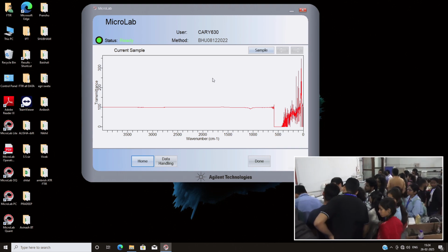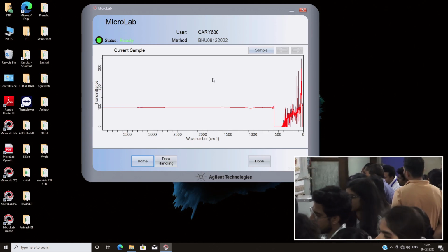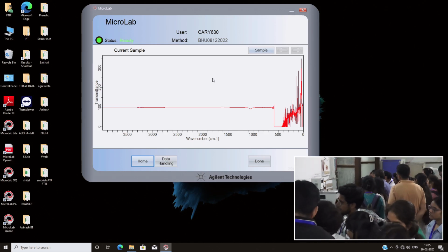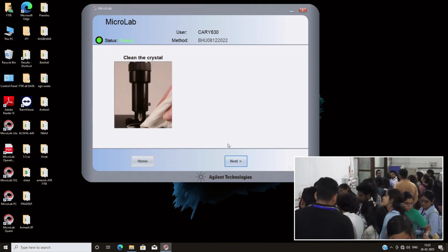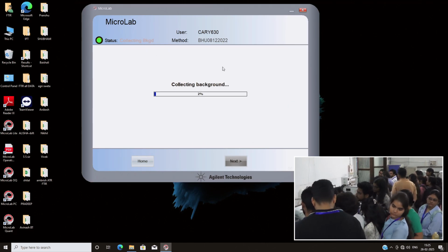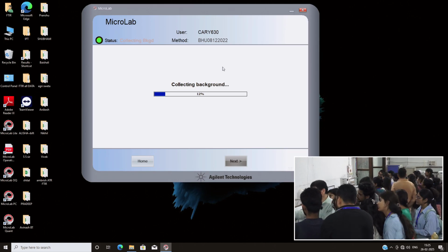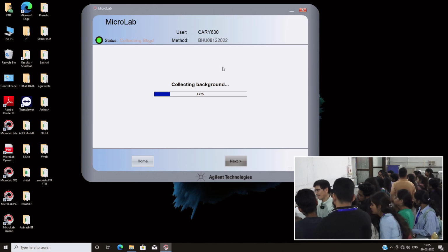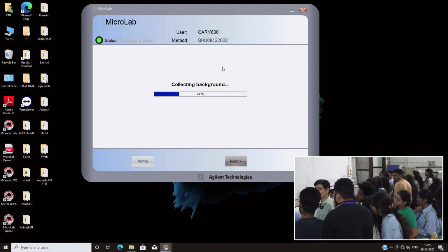Okay, there was a small mistake, so let's try again. Well, you may measure the I0 spectrum twice. Once you measure I0, but I'm not sure. Every time you need to measure I0 and I, probably.